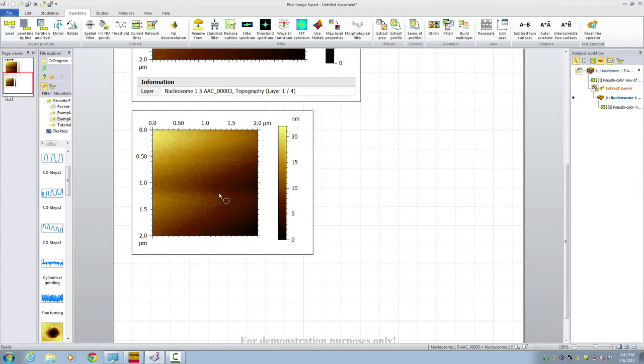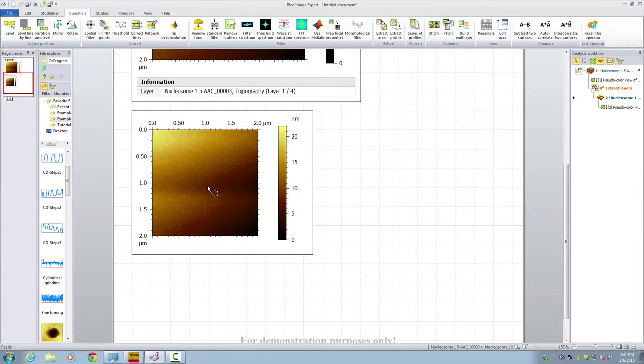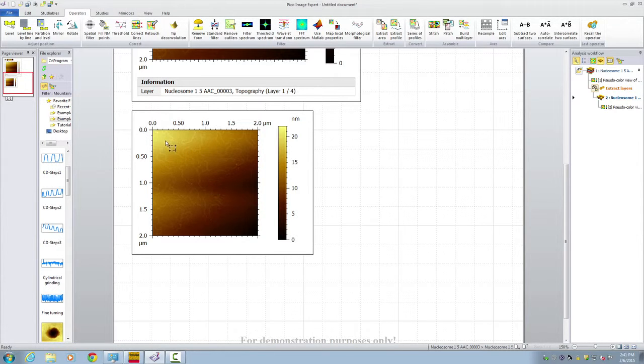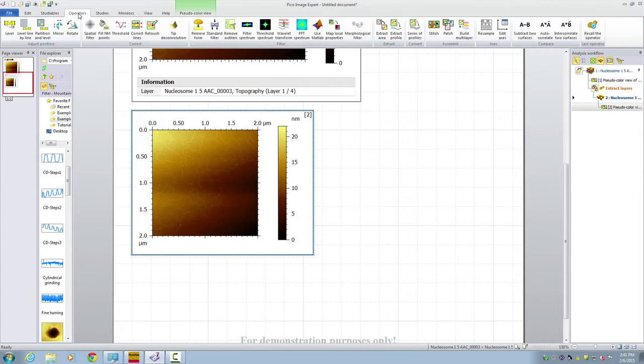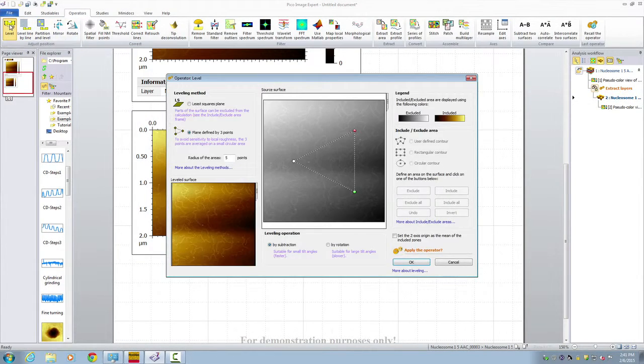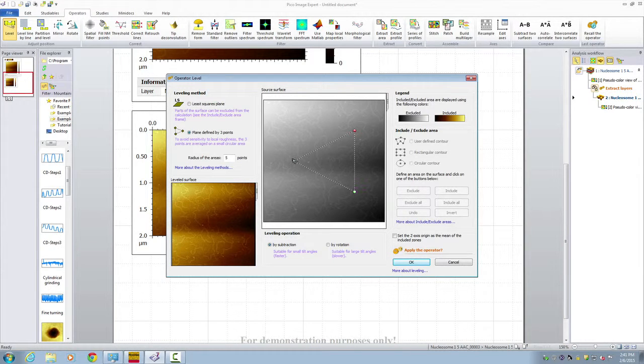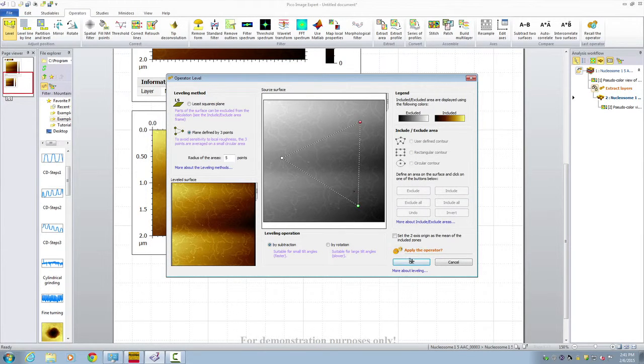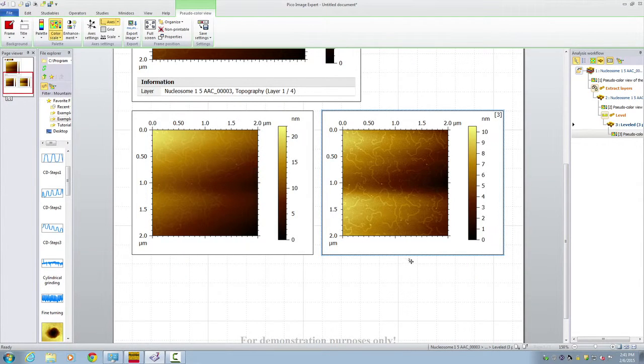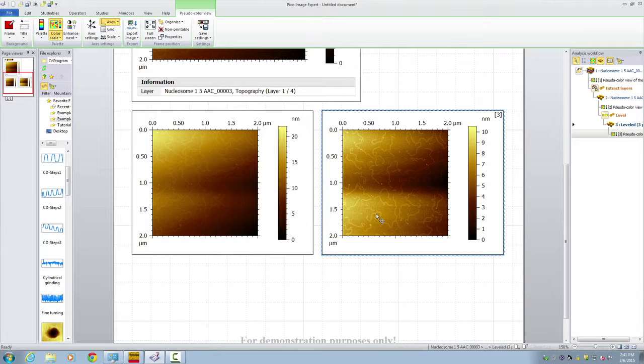Now the first step of an AFM image is to remove any tilt and line noise from the image itself. Typically we would use something simple as a level. So click here, go to operators, level, and we choose a three point level. We choose three points to define a plane. And click OK. The software will generate an image that's correct through the three points.